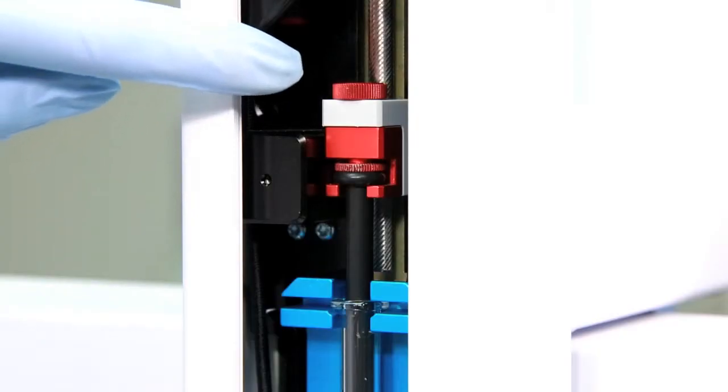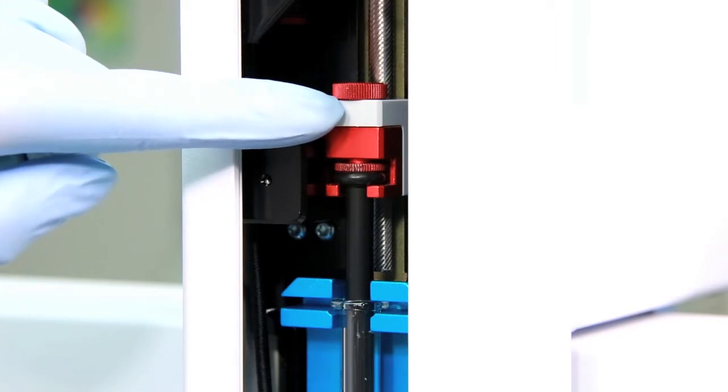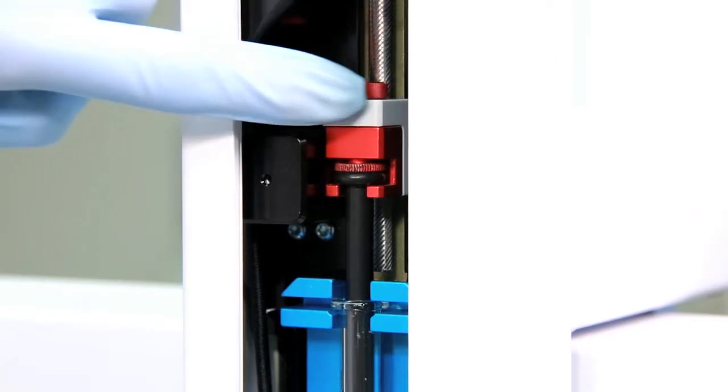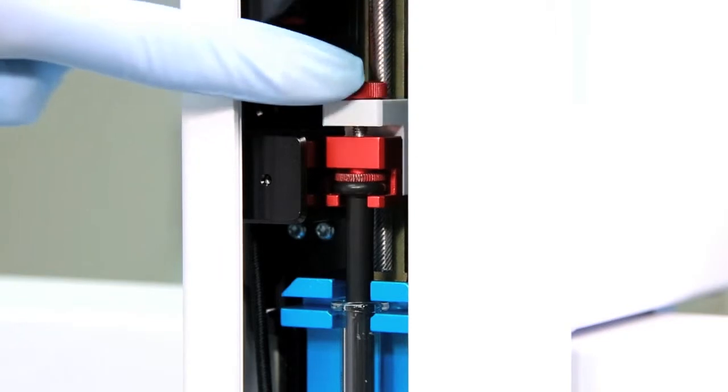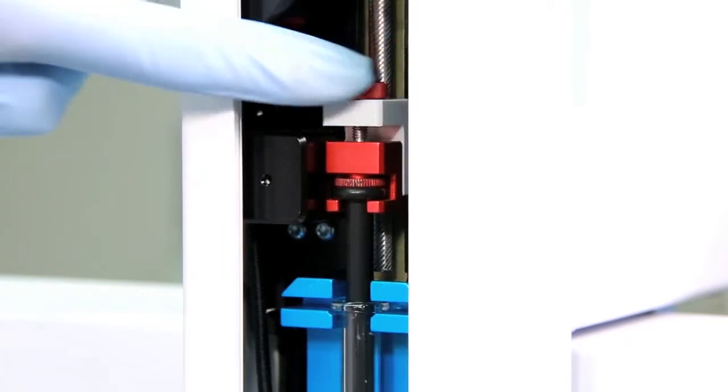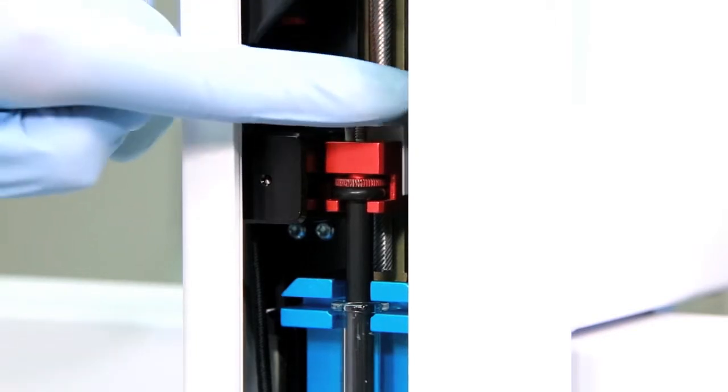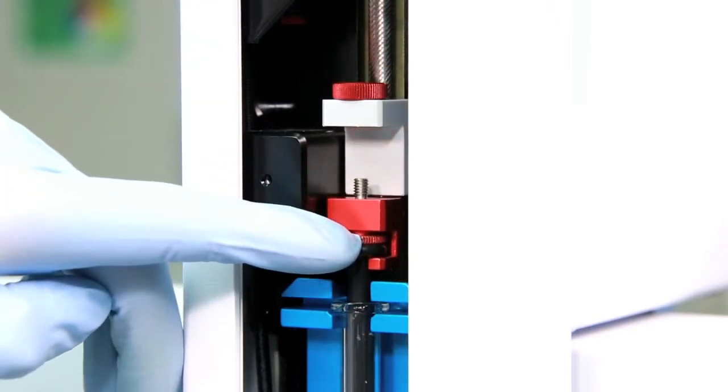To remove the syringe you first have to loosen the upper red retaining nut completely. You can see the plunger is moving down. When the nut is fully loosened, move the syringe plunger all the way down.